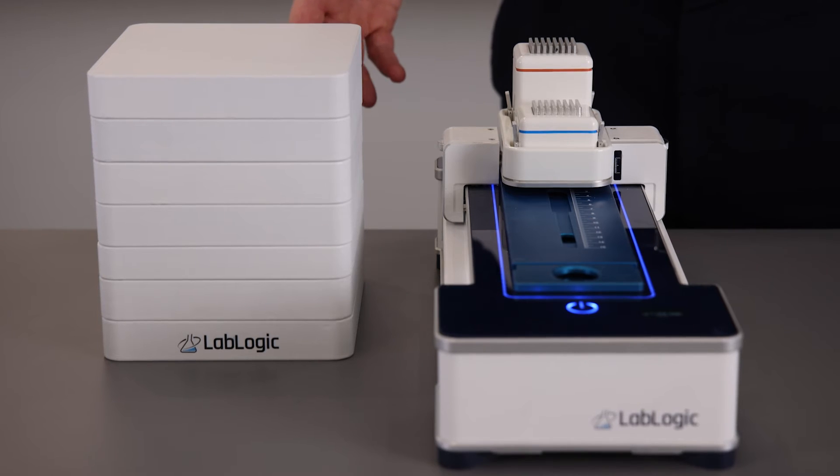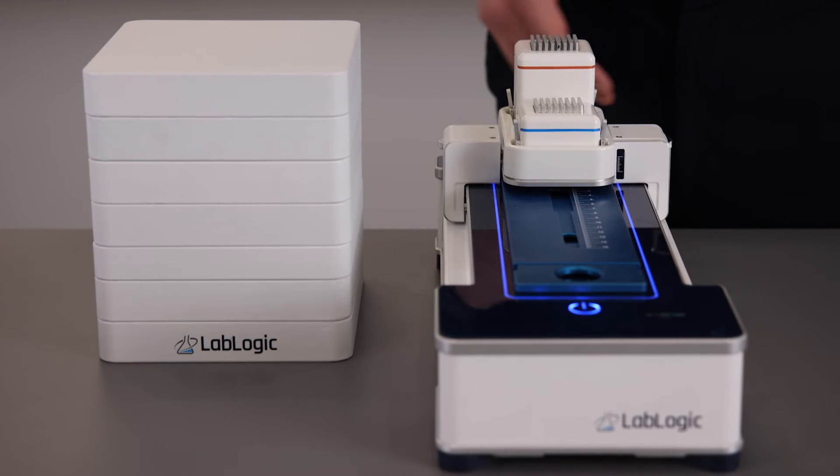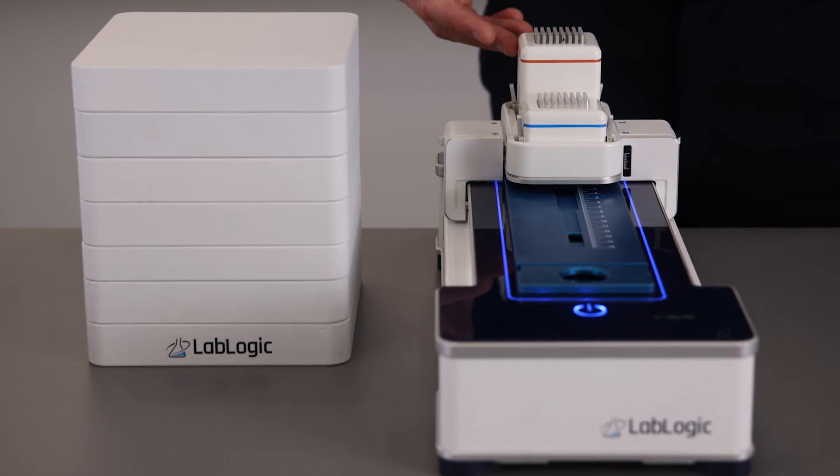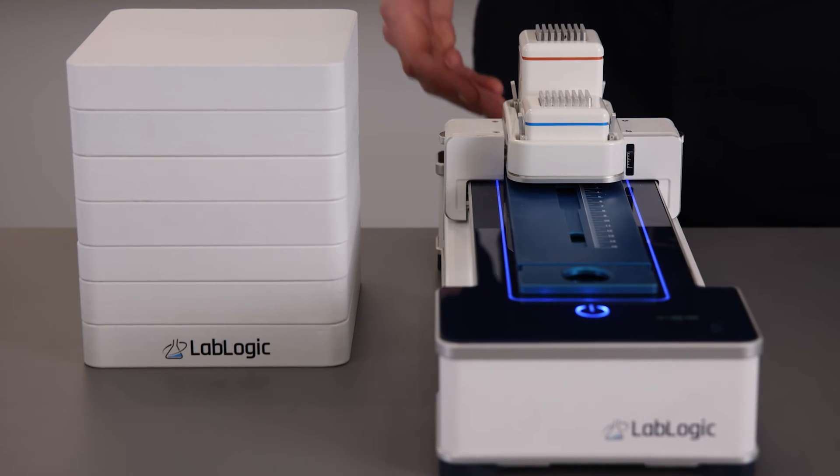The new all-in-one ScanRAM combines the functionality of a radio TLC scanner, a radio HPLC detector, and a gamma spectrometer in one highly flexible system.